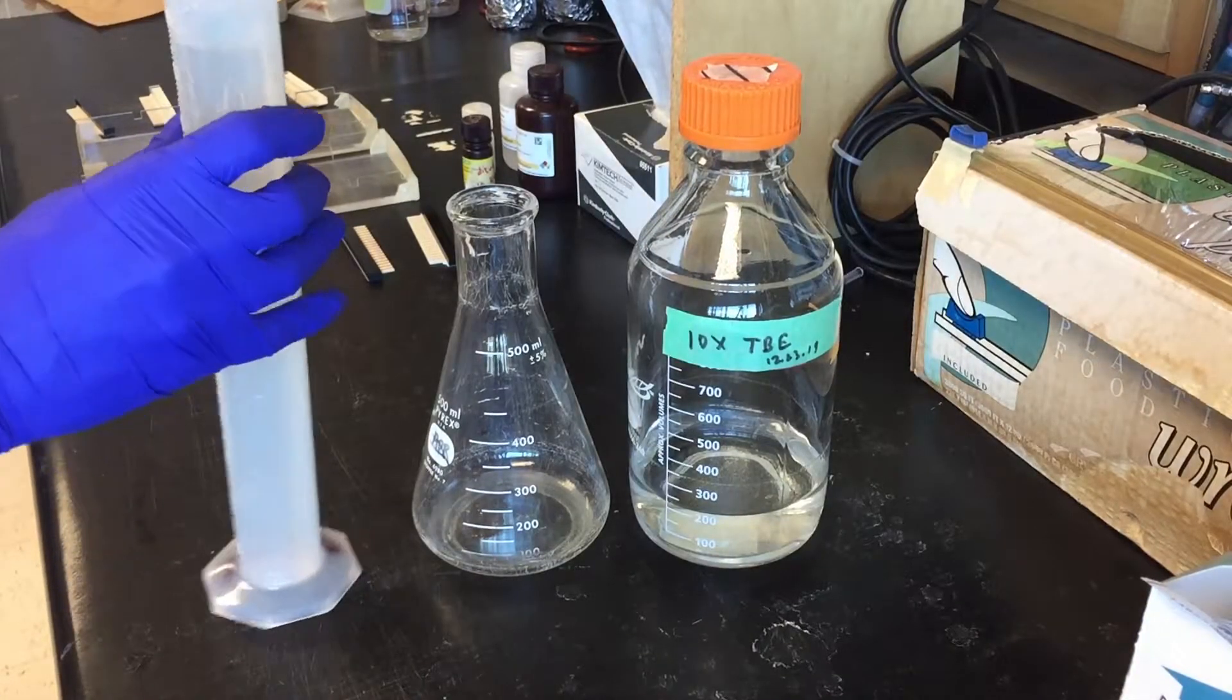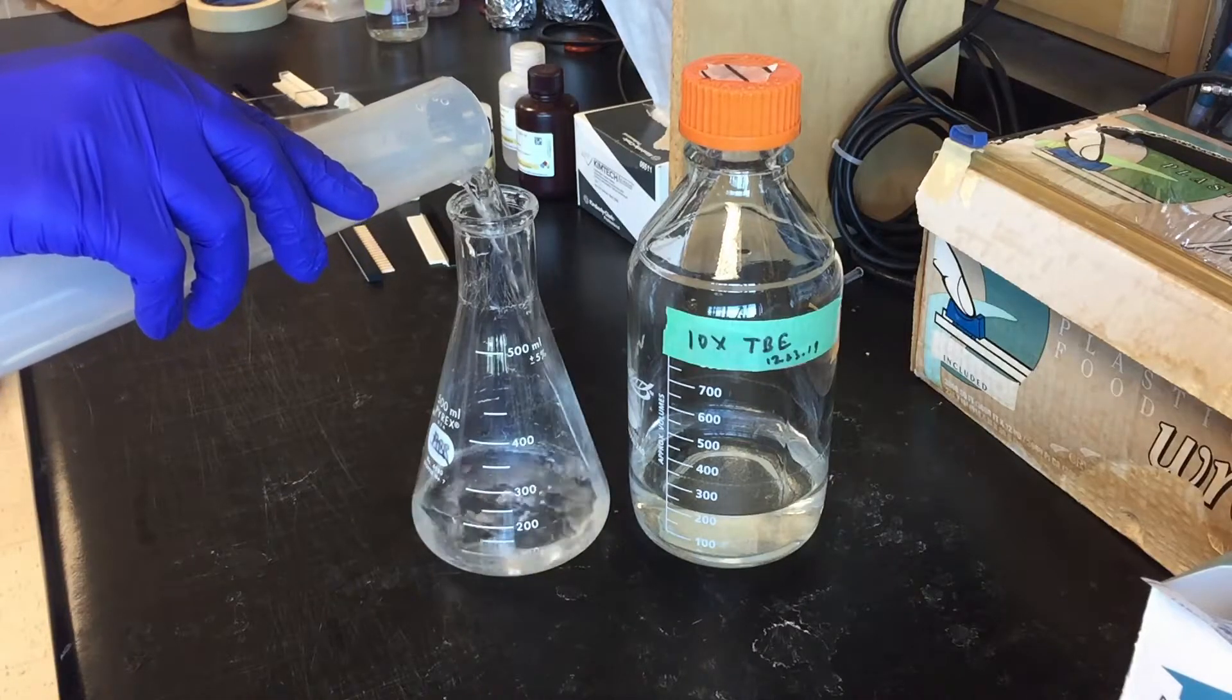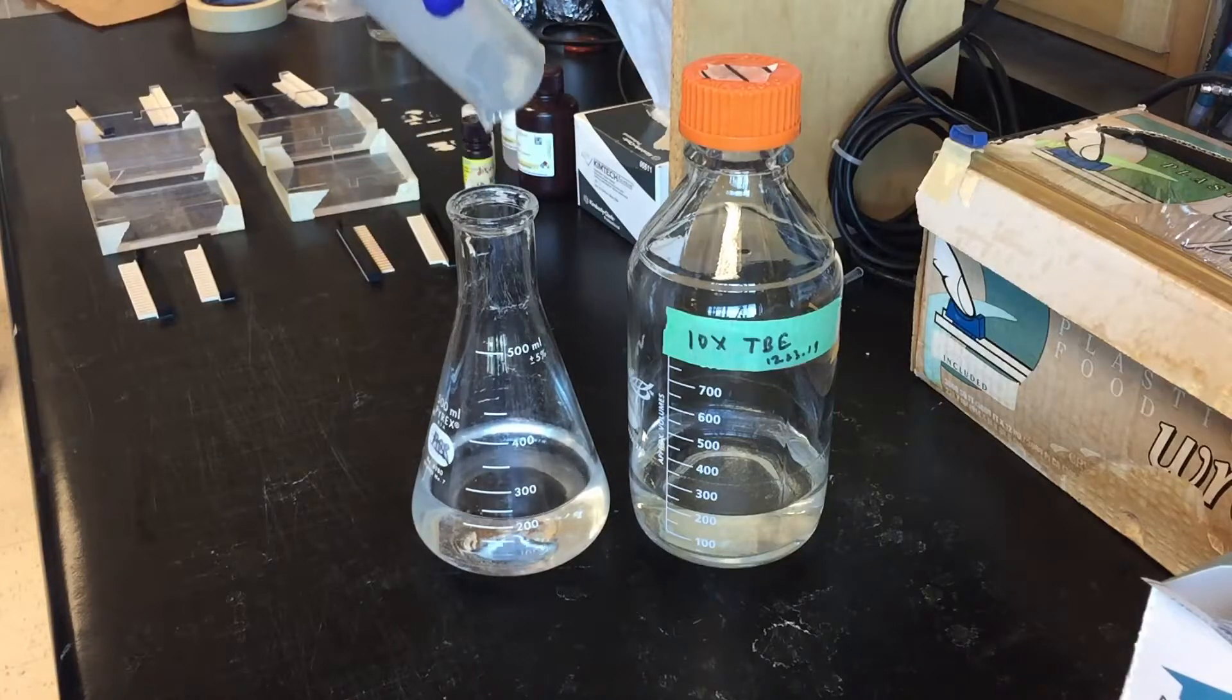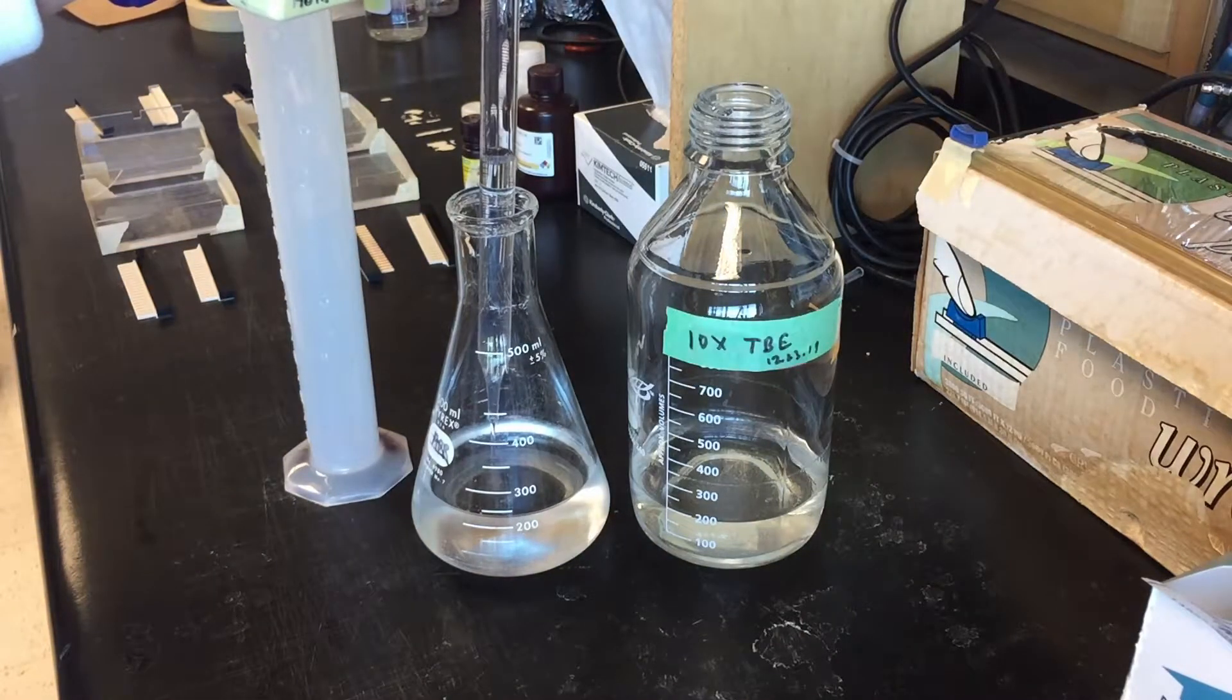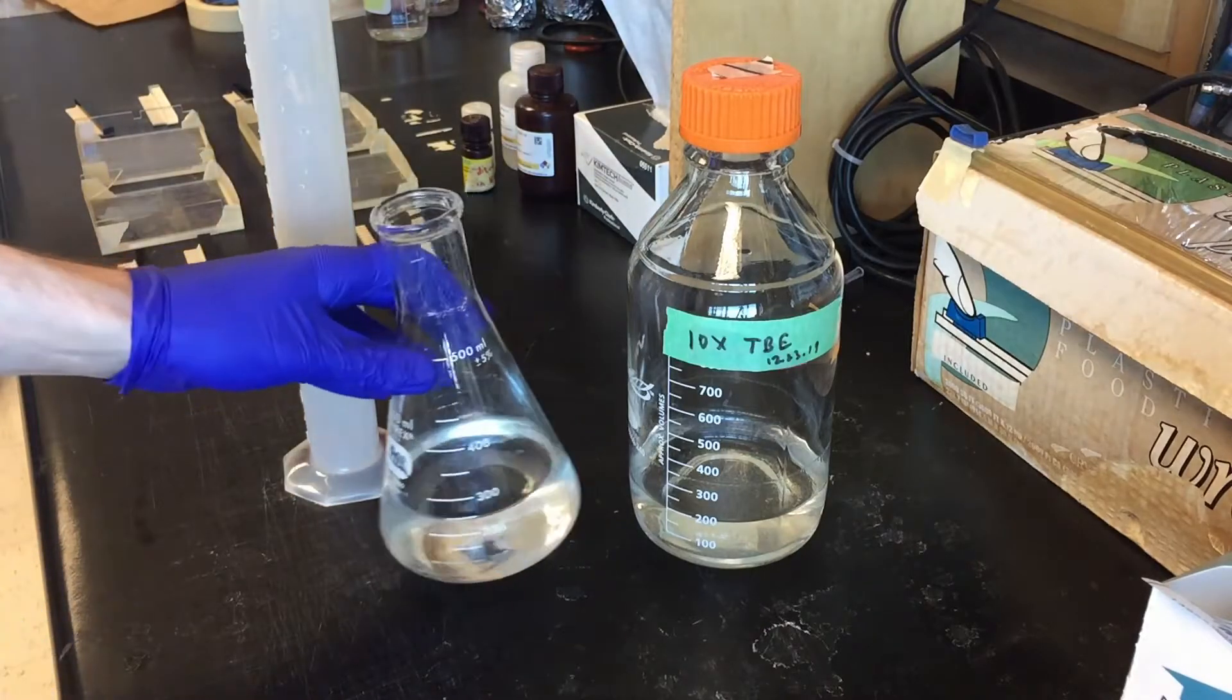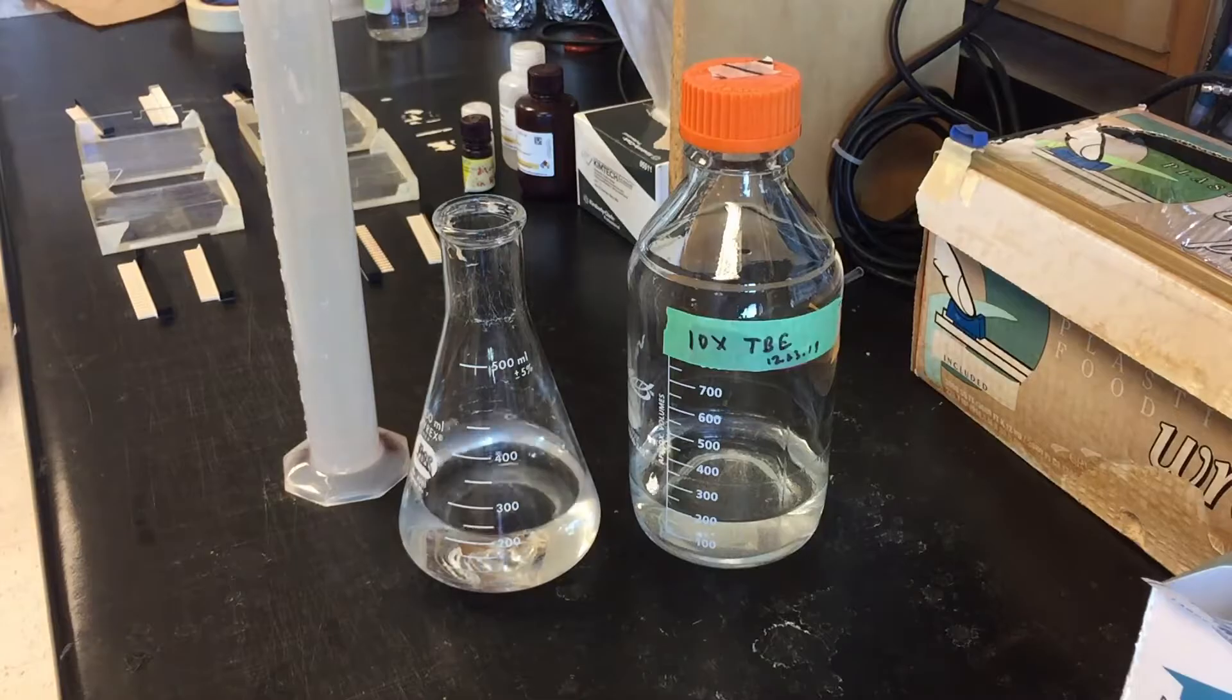I'm going to aim to make roughly one percent agarose gel using 1x TBE. TBE is just tris and borate which are slightly basic buffers and they'll provide ions for the electrophoresis, and EDTA which is a chelating agent for minerals like magnesium. We're using it to prevent enzyme activity in things like polymerase or nucleases.